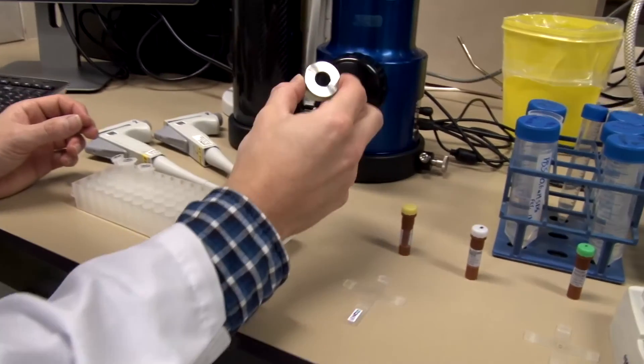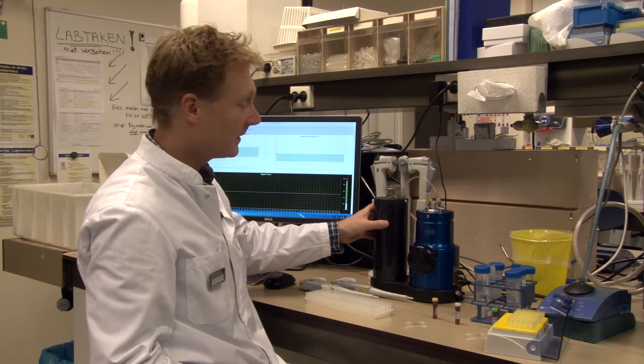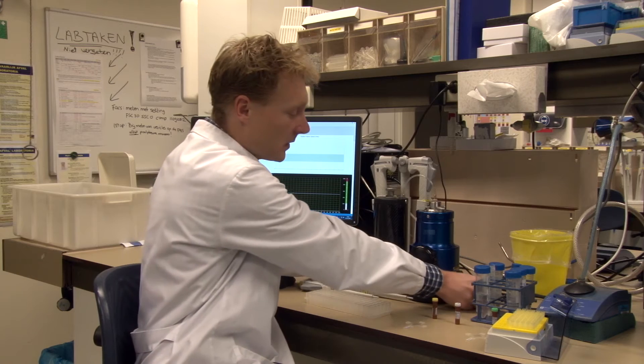To shield the device from external radiation, we place the Faraday cage. The black component here is a pressure module — a manometer. We apply an external pressure to the sample of 7 centimeters of water.